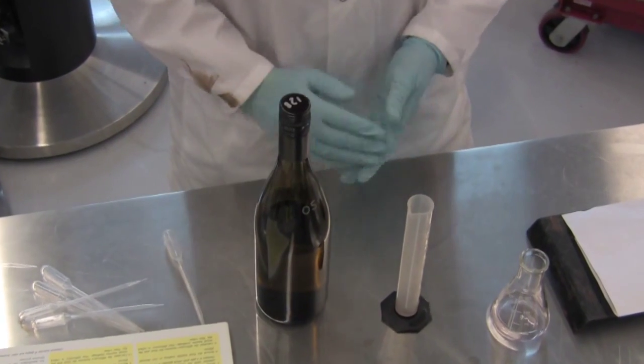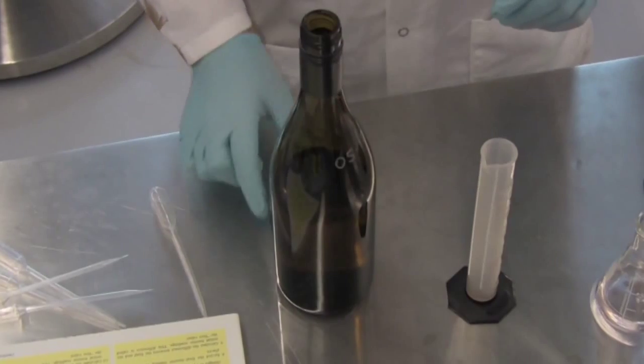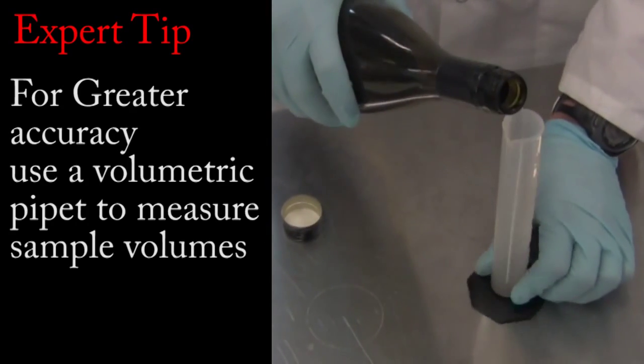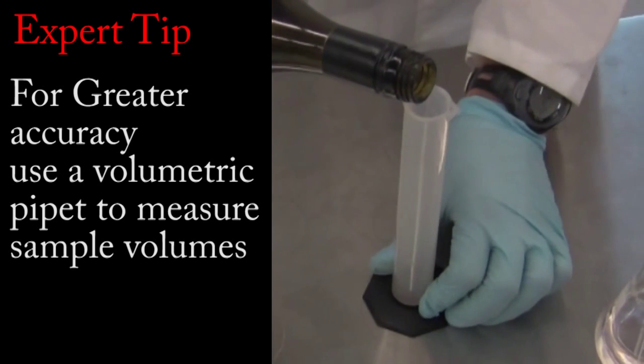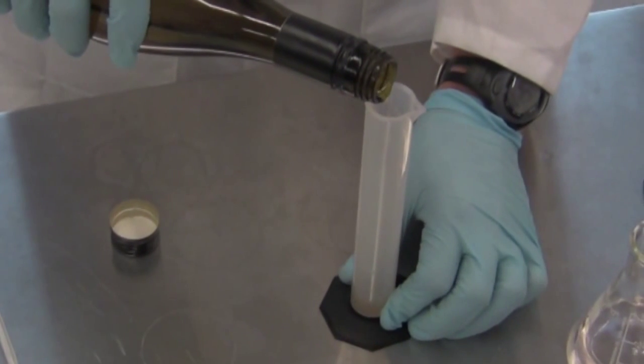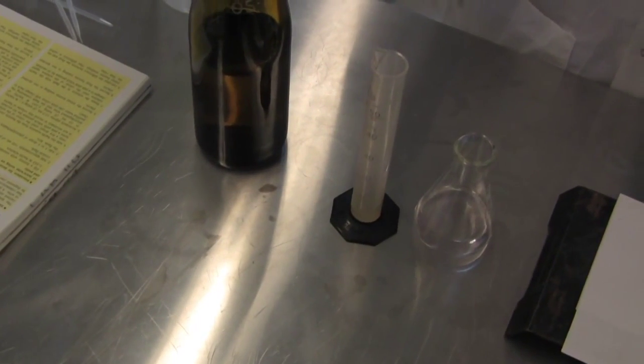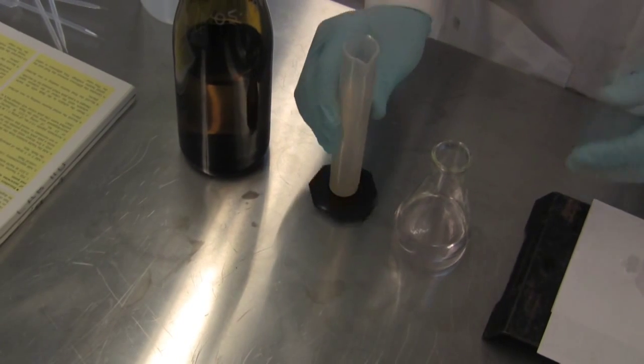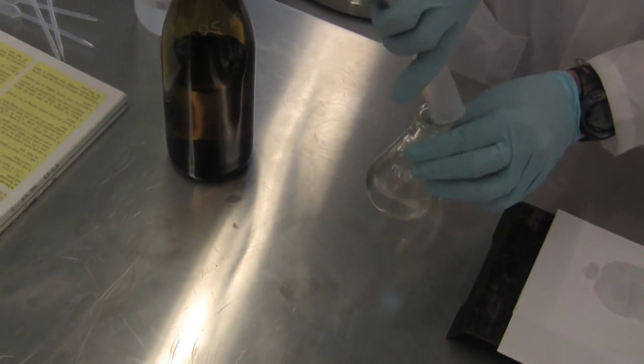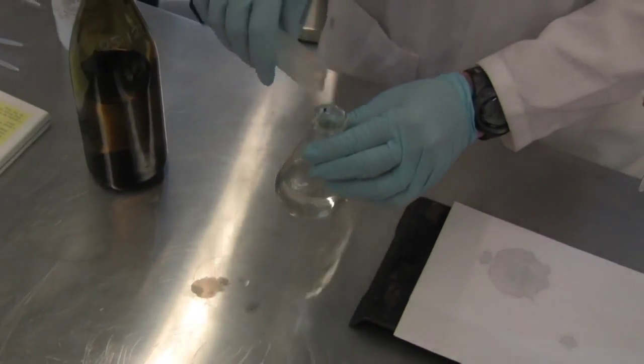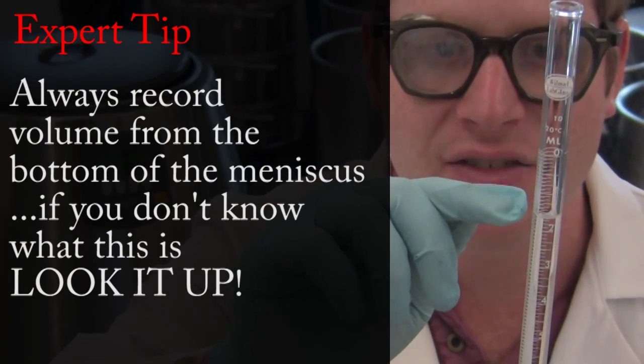So the next step is to add our wine. Now this is where accuracy counts. We need to add exactly 10 milliliters of our wine sample to our flask. I'm using a 50 ml graduated cylinder. So we've got our 10 ml of wine in our graduated cylinder, and we're going to add that to our water and phenolphthalein indicator that's already been titrated to a light peach endpoint. Before we start, we need to record our initial volume, 1.70.